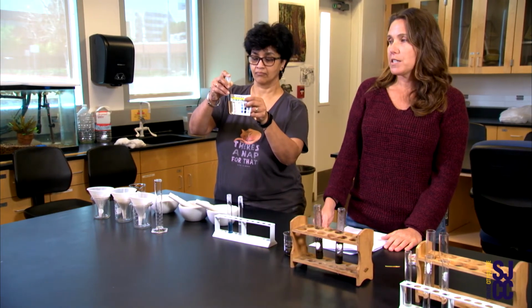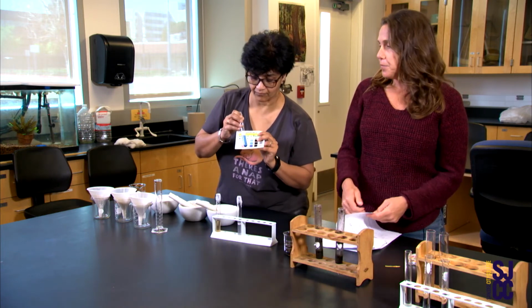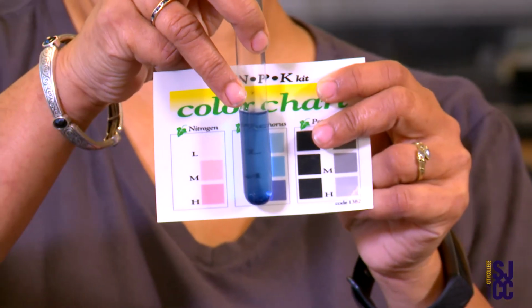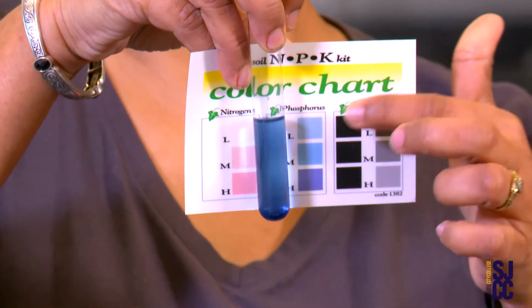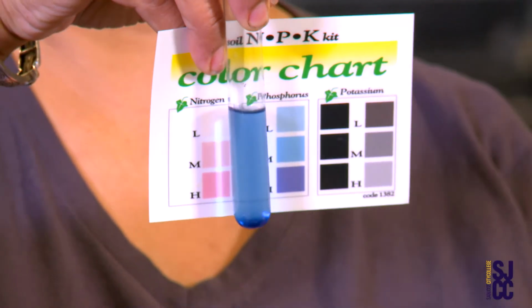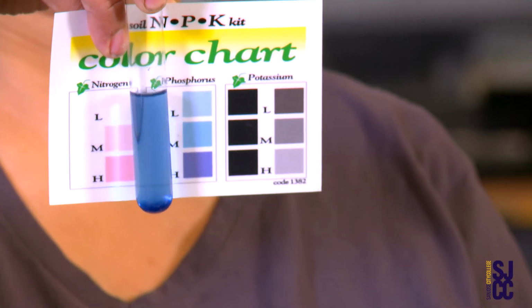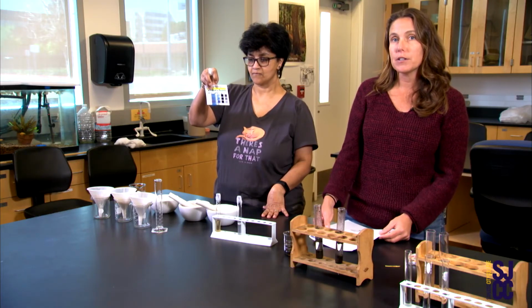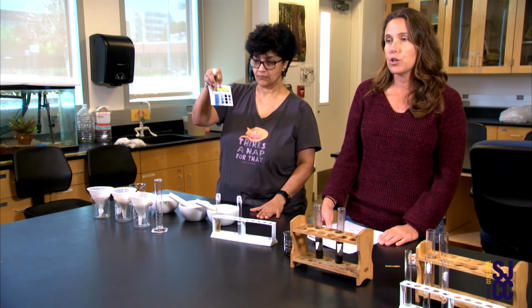The next one we did was the phosphorus test. And we basically, again, extracted phosphorus from the soil and used a color indicator to look at the phosphorus content in the soil. Phosphorus is usually amended by rock material, and eroded material from that rock gets into our soil concentration.